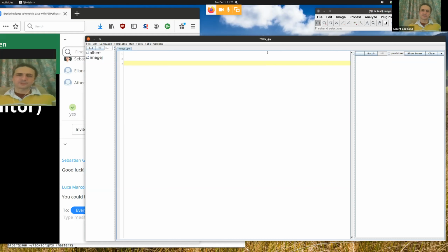So I'm going to start by illustrating with these very simple examples what I'm talking about here. So let's create a program that can do that. So first of all, I'm going to need to create a listener. And so for that, I'm going to make a class, and I'm going to call it the file open listener.